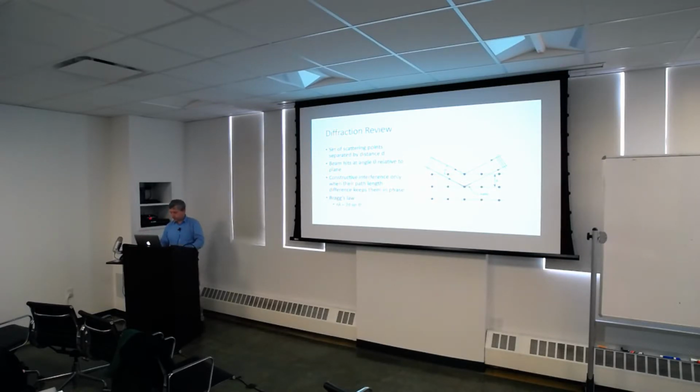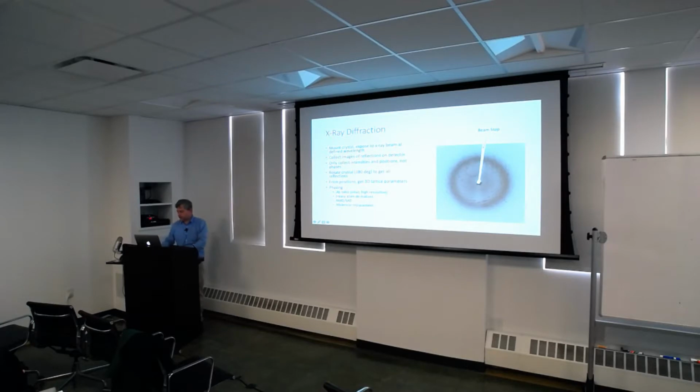In an X-ray experiment, you hit the crystal with an X-ray beam, look at what diffracts, and collect diffraction spots. This is what an X-ray diffraction pattern looks like. I'm not sure if when you do an X-ray experiment you actually see this, or if everything is done by the computer now. You still see the diffraction, yeah, you've got to see it. I'm not sure. I guess so, because otherwise you'd go on to the next crystal if it doesn't work.